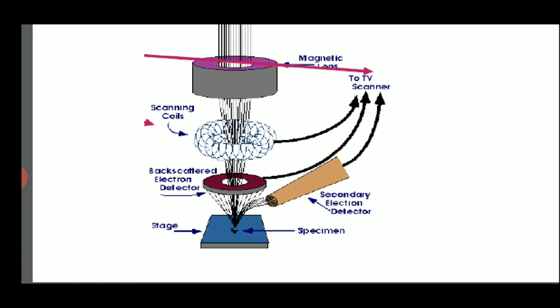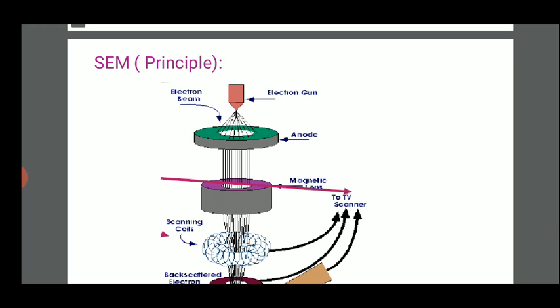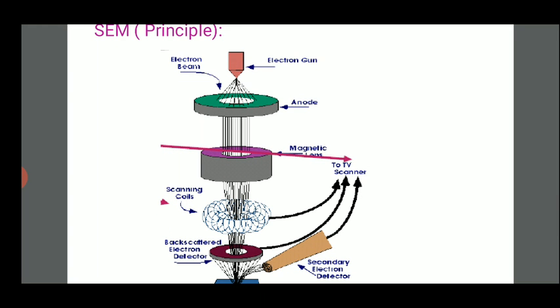So here is how the scanning electron microscope works, its principle.